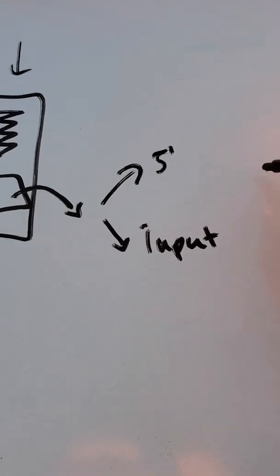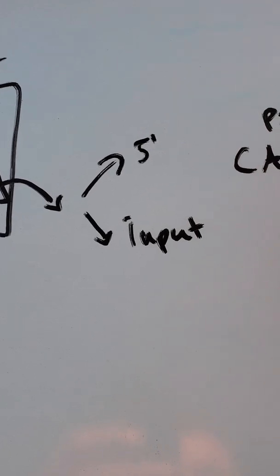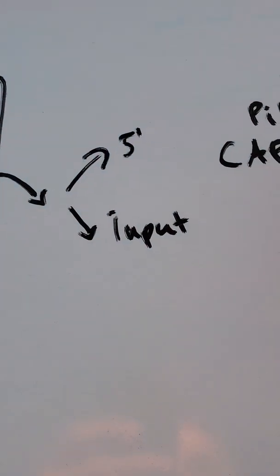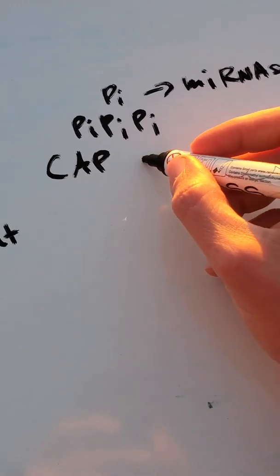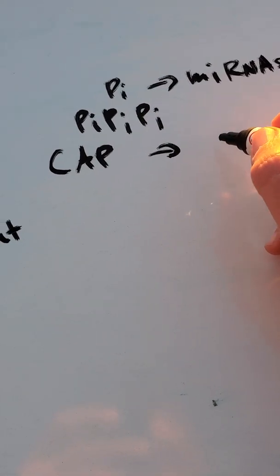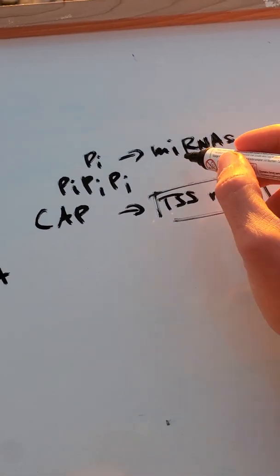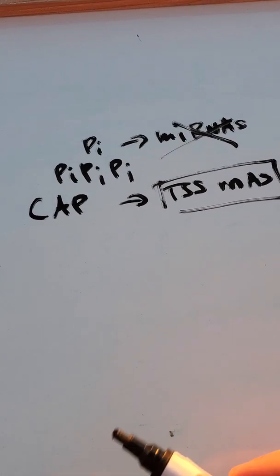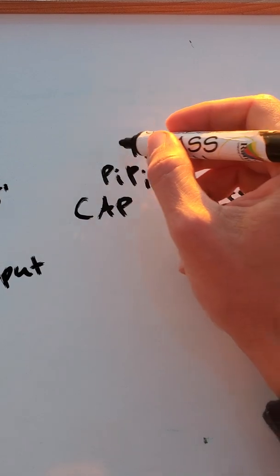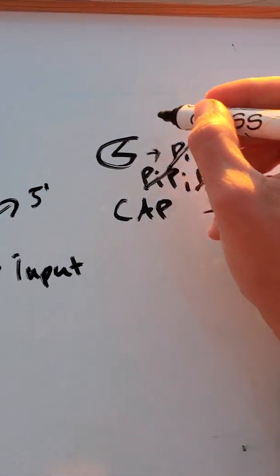What does that actually mean? We have different modifications like the cap, triphosphorylation, diphosphorylation or monophosphorylation. This is especially the microRNAs and other small RNAs. And this is basically our short initiated RNAs, which is sort of the TSS RNAs, right? And this is what we want. And so we depleted this using two ways, which is the terminator and the CIP. Terminator removes only these ones here, right, while CIP removes all the different phosphates.